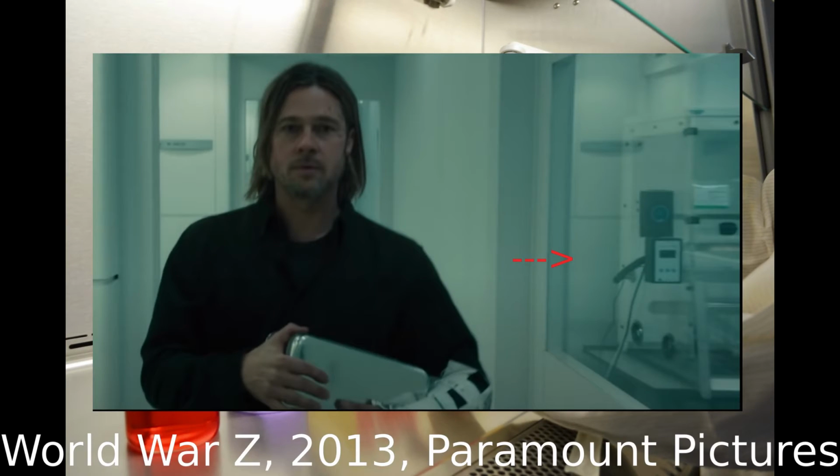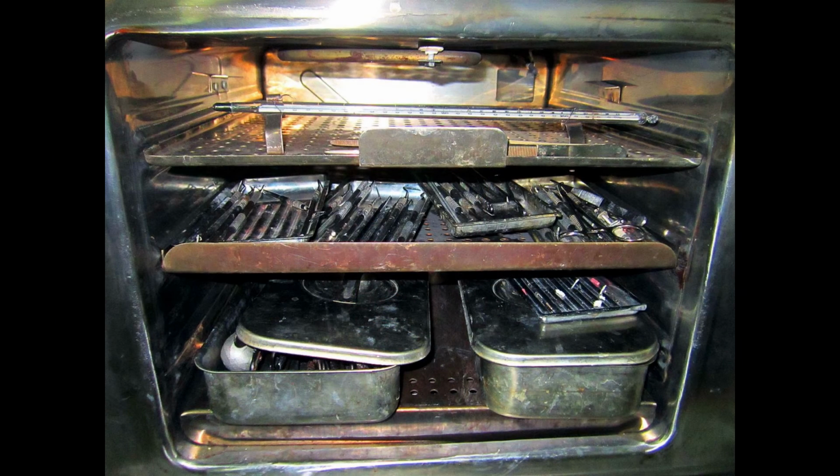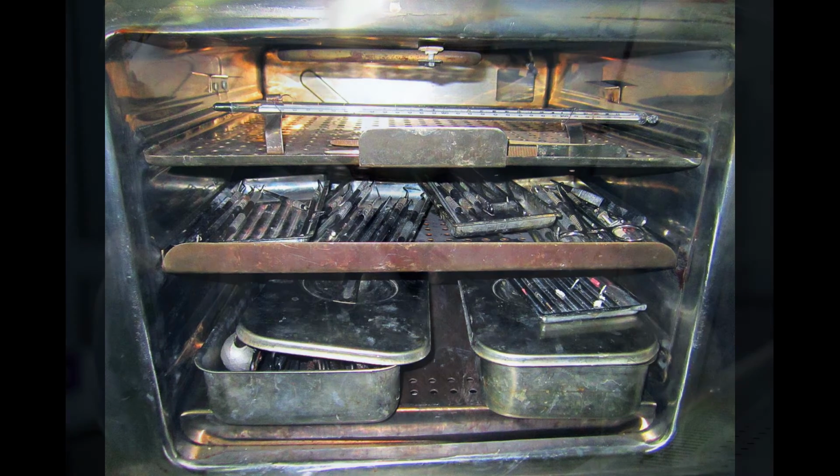This includes the use of a biological safety cabinet. This is, in fact, very similar to a chemical fume hood. The differences are largely around the fact that it doesn't draw the material away as readily, often also contains things like UV lights that would destroy anything that's in there between uses. Further to that, material and equipment that is used should be put through an autoclave or other method of decontamination.